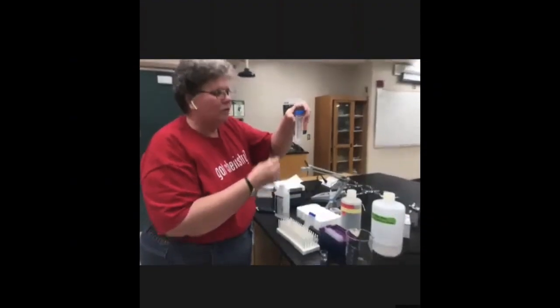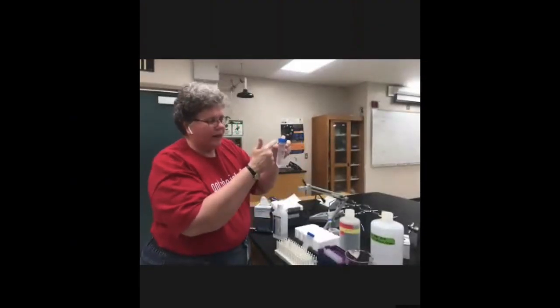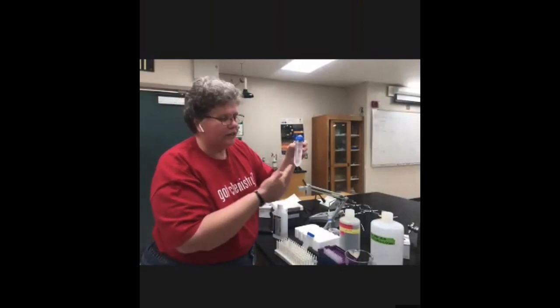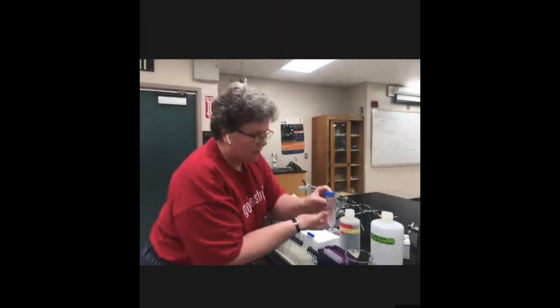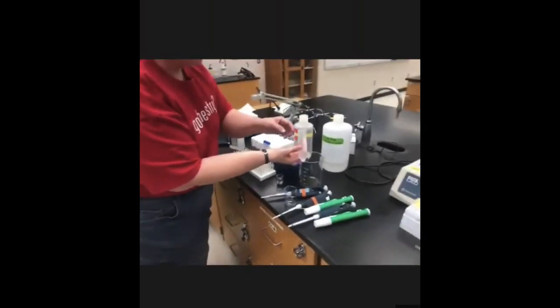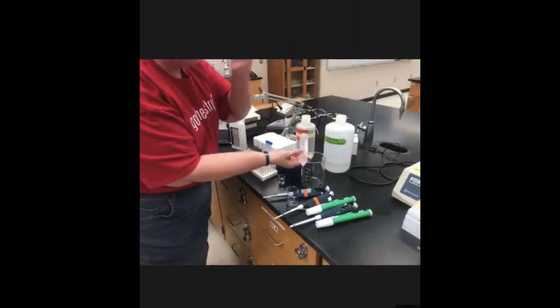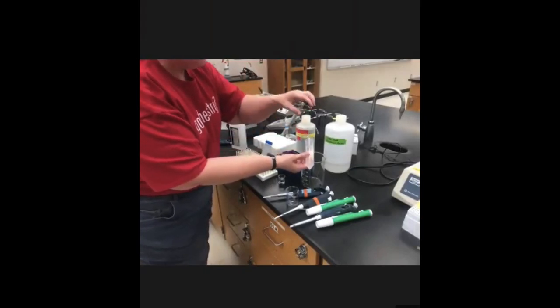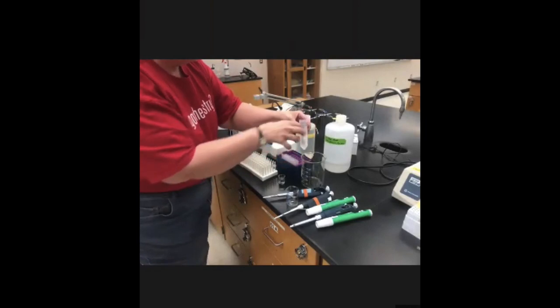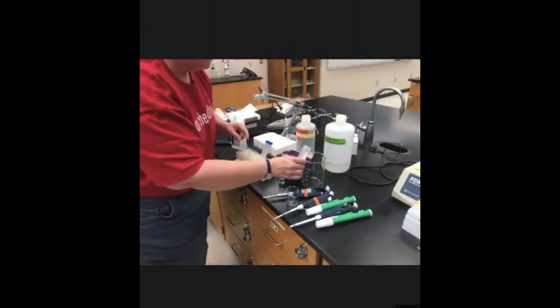So now, after an overnight ethanol precipitation, we have spun our precipitated DNA for 20 minutes, and then you're going to pour off the supernatant. Now remember, when you're pouring off the supernatant, you have to commit. You have to make sure that it's all in one clean pour, not a back-and-forth pour, because that will dislodge your pellet.